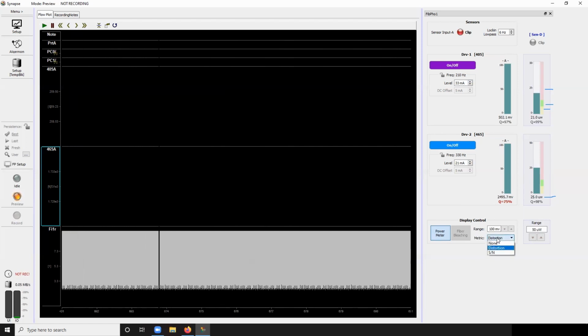So what you get is this high signal to noise. It's always going to be Q factor here, but you can toggle this between Q and signal to noise over here. I just leave it as Q factor. It's really a distortion metric. If the Q factor is low, that means you have a distorted 330 hertz or 210 hertz. And you'll see that is the case over here, because since we're clipping on the top end, your signal actually looks like this. And so you're not picking up 330 hertz, because it's flat at the top.